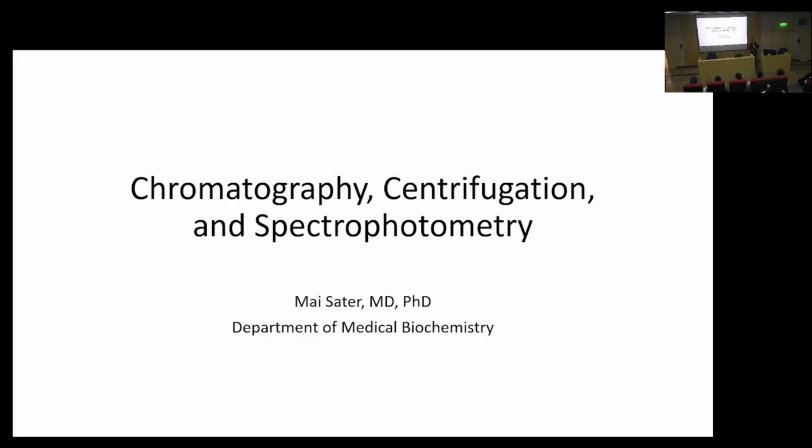All right, so today's session, we're going to talk about some basic lab techniques in biochemistry, and these techniques are typically involved in separating things from one another. Whether it's chromatography or centrifugation, you'll see that there is a common theme: they involve separating molecules, chemicals, proteins or cells. We will also talk about a very important technique in biochemistry, and that is spectrophotometry.